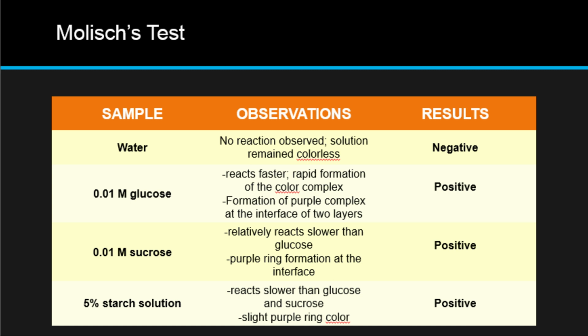All carbohydrates will give a positive result. However, monosaccharides give a rapid positive result relative to disaccharides and polysaccharides.